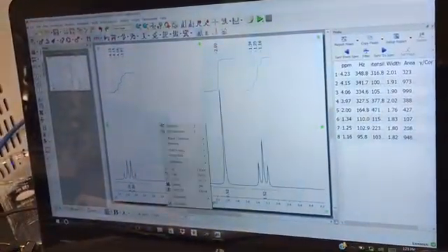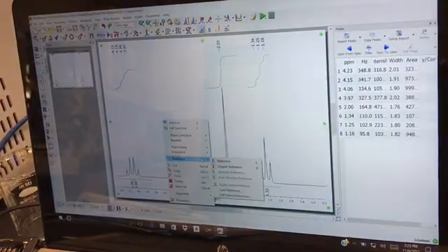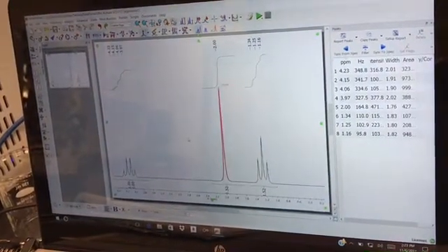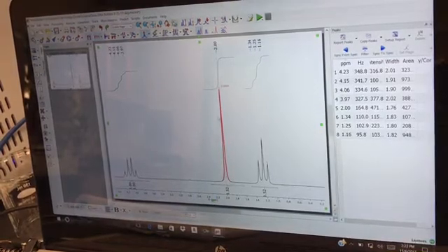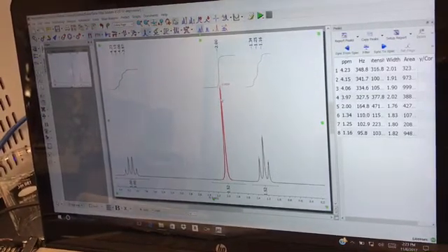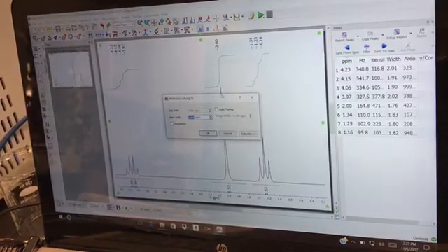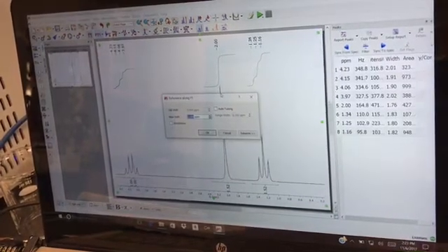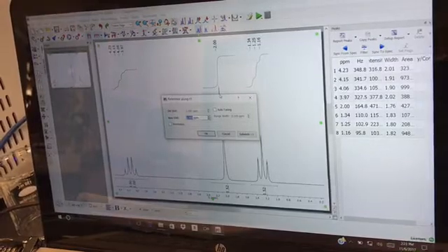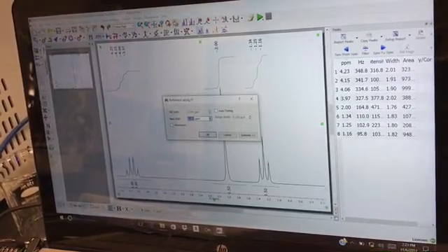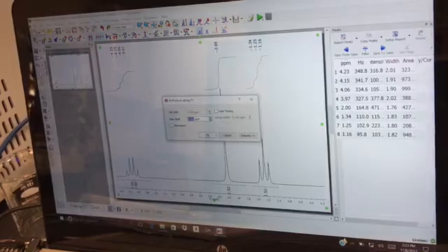Next, you're going to right-click, go down to Reference, and select Reference. With your professor's help, you'll select your reference peak. In my case, I know that it's this one in the middle, so I will select this one. You're going to enter the reference value for your solvent based on your professor's recommendation. In my case, I know that it's two, which is already here, so I'm going to select OK.